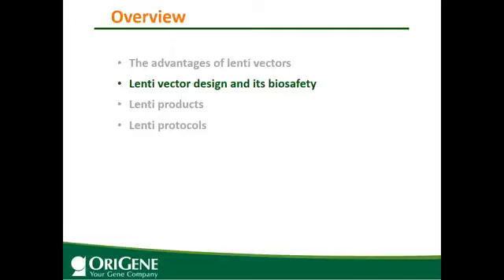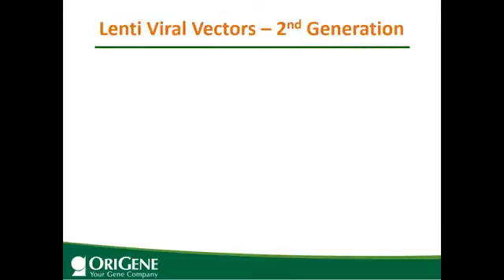So now from the transduction data, you can see that lentivirus is a great gene delivery tool. Now, because lentivirus can infect human cells, you may have a concern. Is it safe to use? The most commonly used lentivectors currently are second generation and third generation vectors. This slide shows the second generation vector.